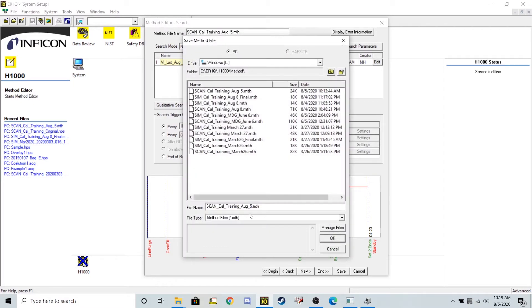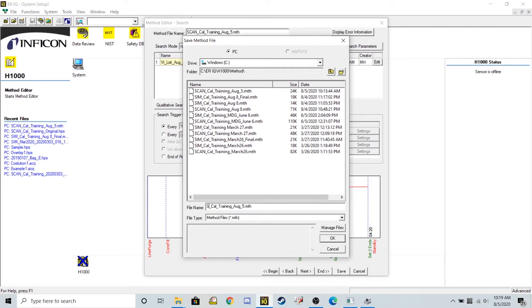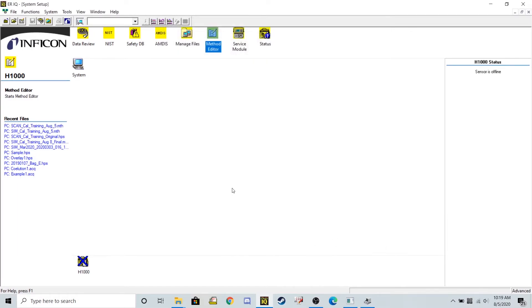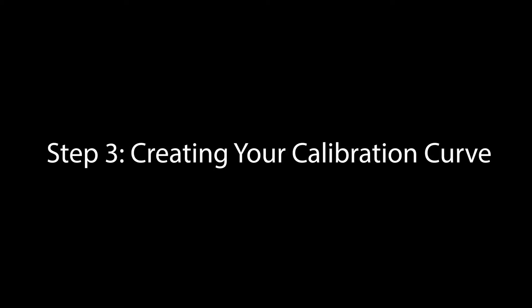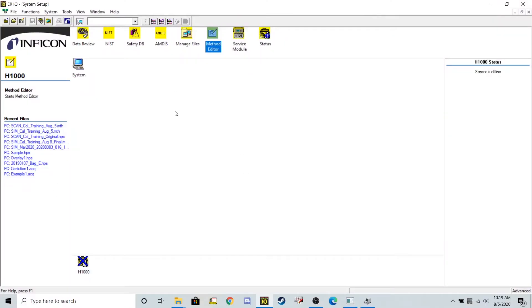And now I'm going to change the beginning part, because it's no longer a full scan method. This is a SIM method, cal training August 5th.